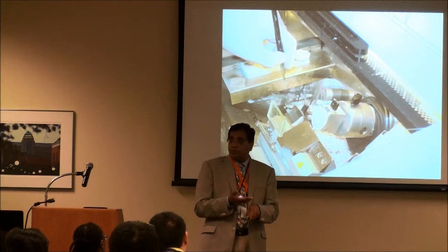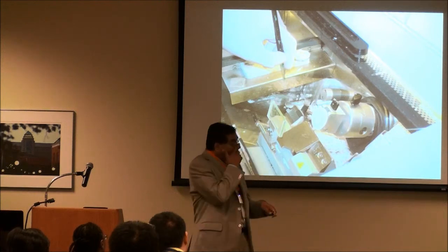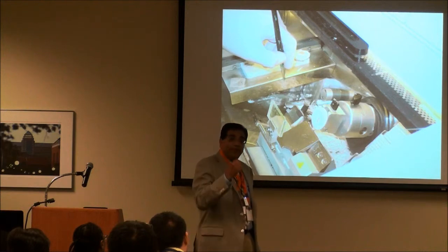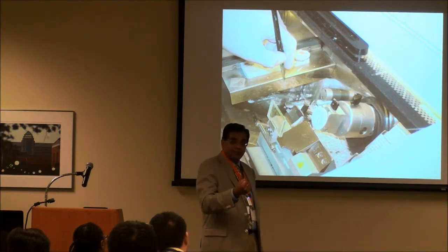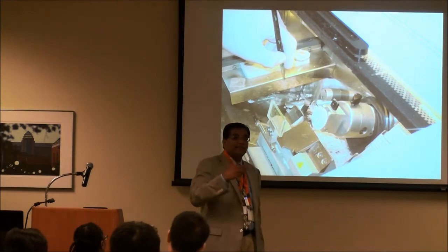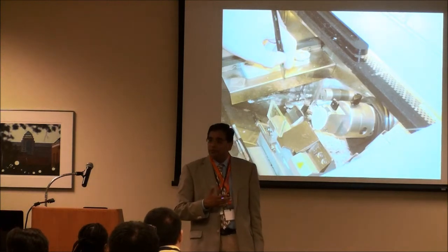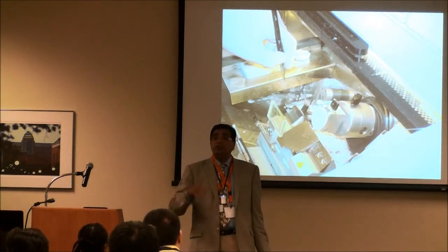You get cold burns. Same thing: this tissue will undergo rapid crystallization, causing artifacts in the tissue. That is a problem with a frozen section. That's why we don't freeze all the tissue.